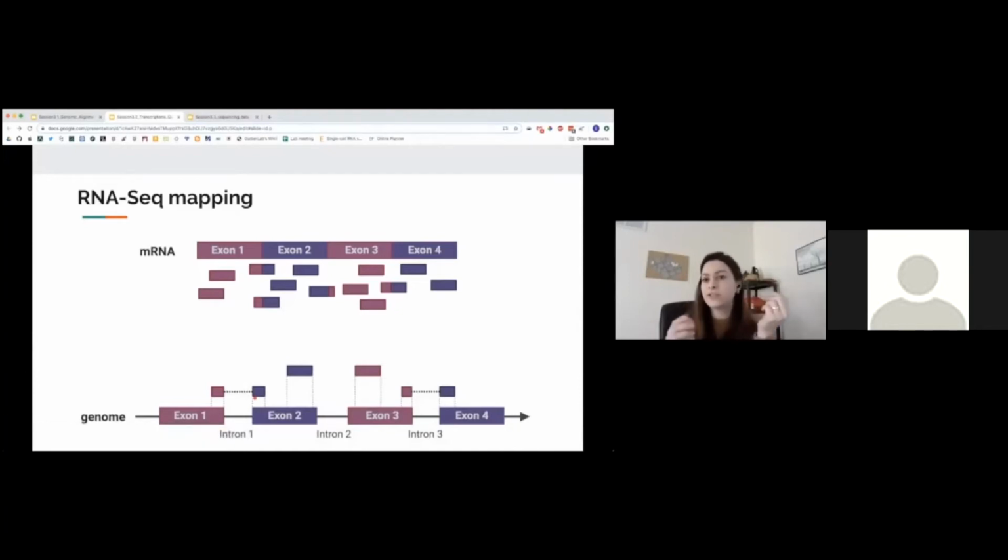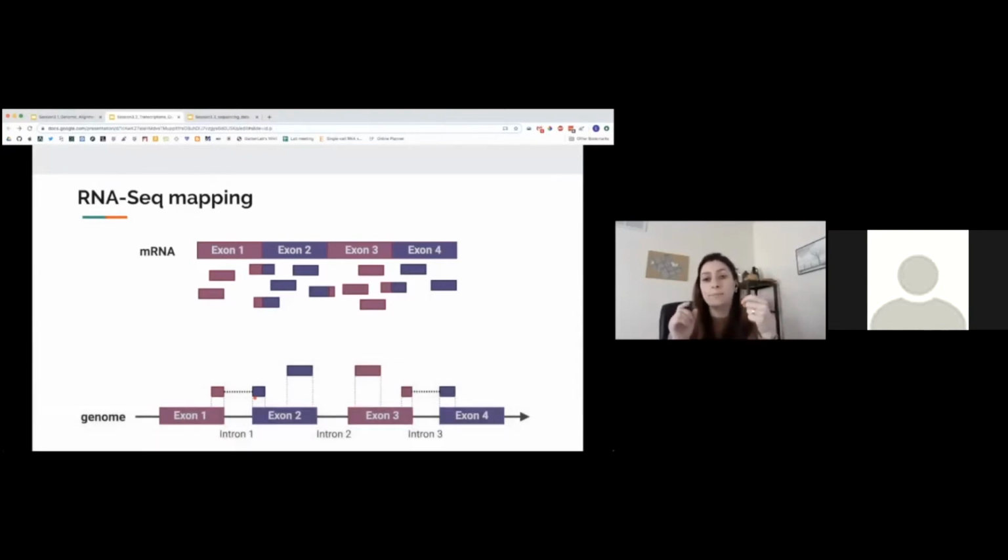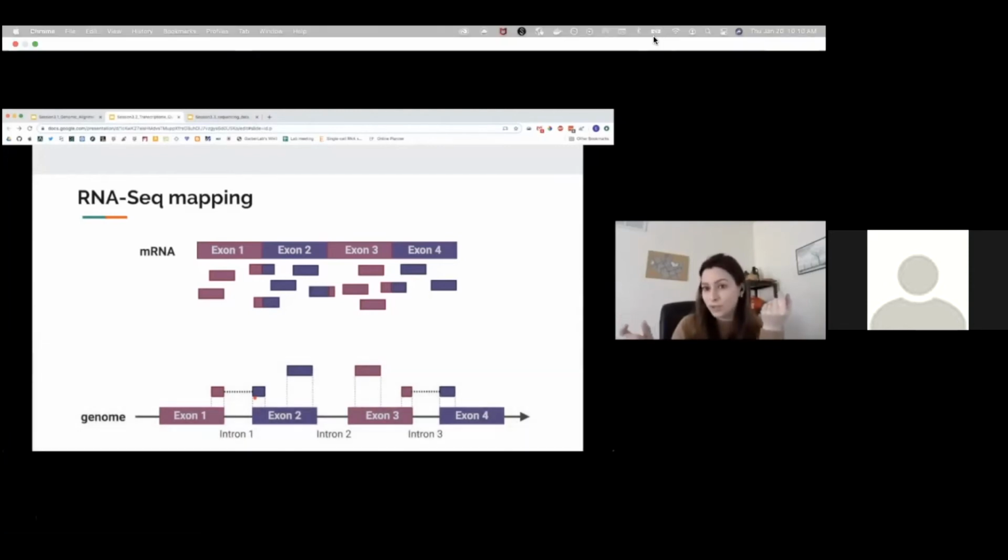An aligner such as Bowtie that aligns to the genome is still able to map sequences that mismatch the genome by a few bases, or even that have short insertions or deletions. What it is not able to do is split a read 20 bases and 30 bases, hundreds of kilobases apart. That it will not do.